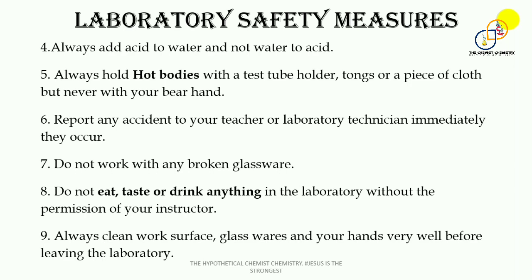They are very harmful, they are dangerous. When you go to the lab and you see anything that looks like water, any colored substances or liquid that looks like a drink, please don't take it. Don't taste anything, don't eat anything unless permission has been given by your instructor.